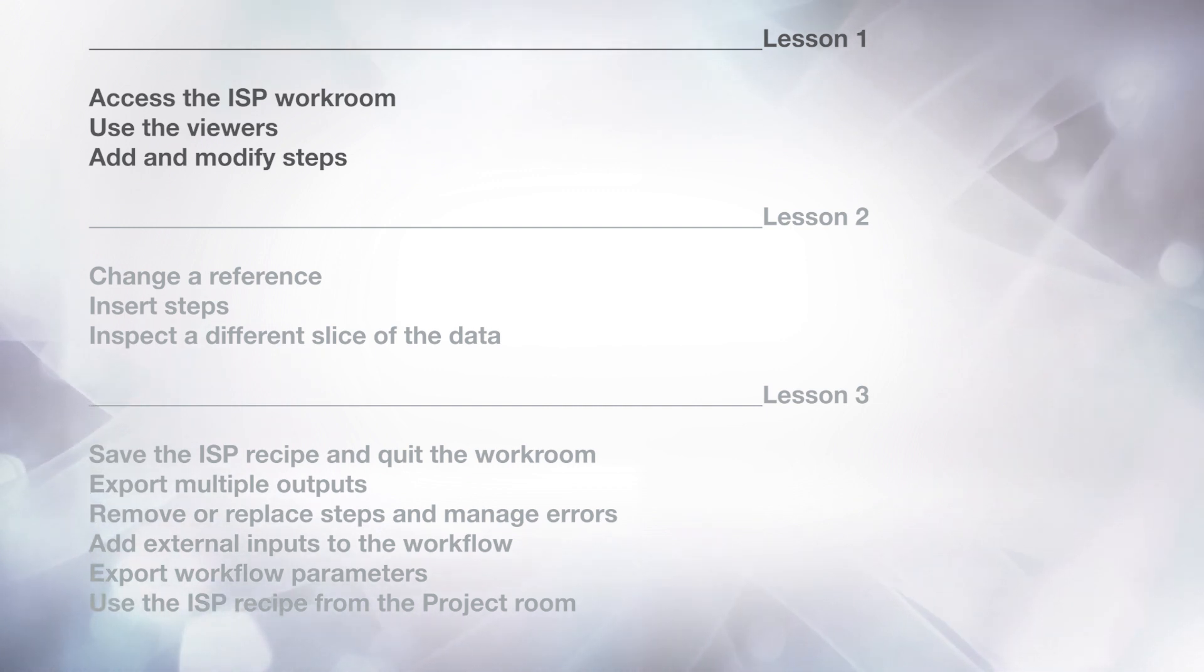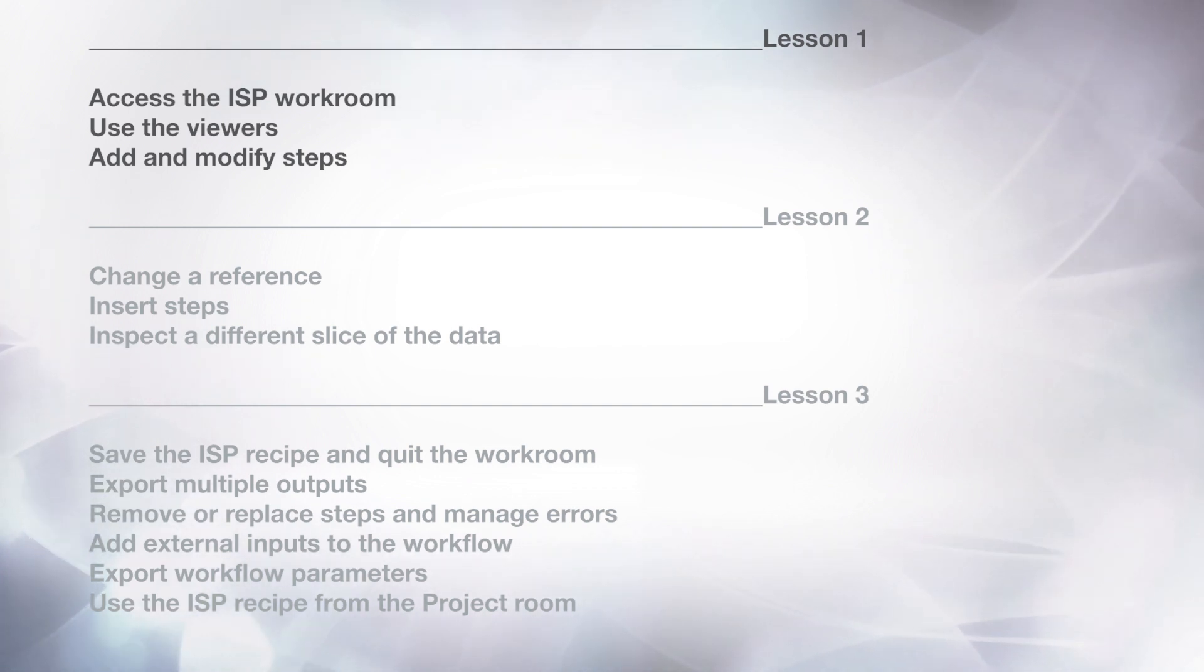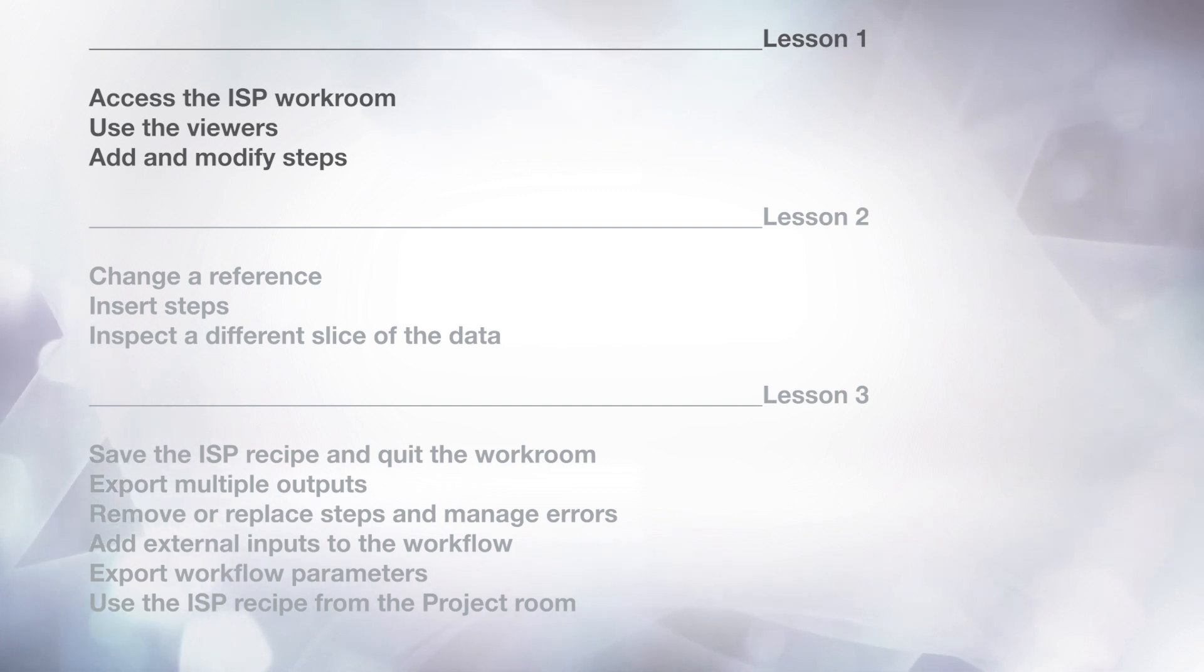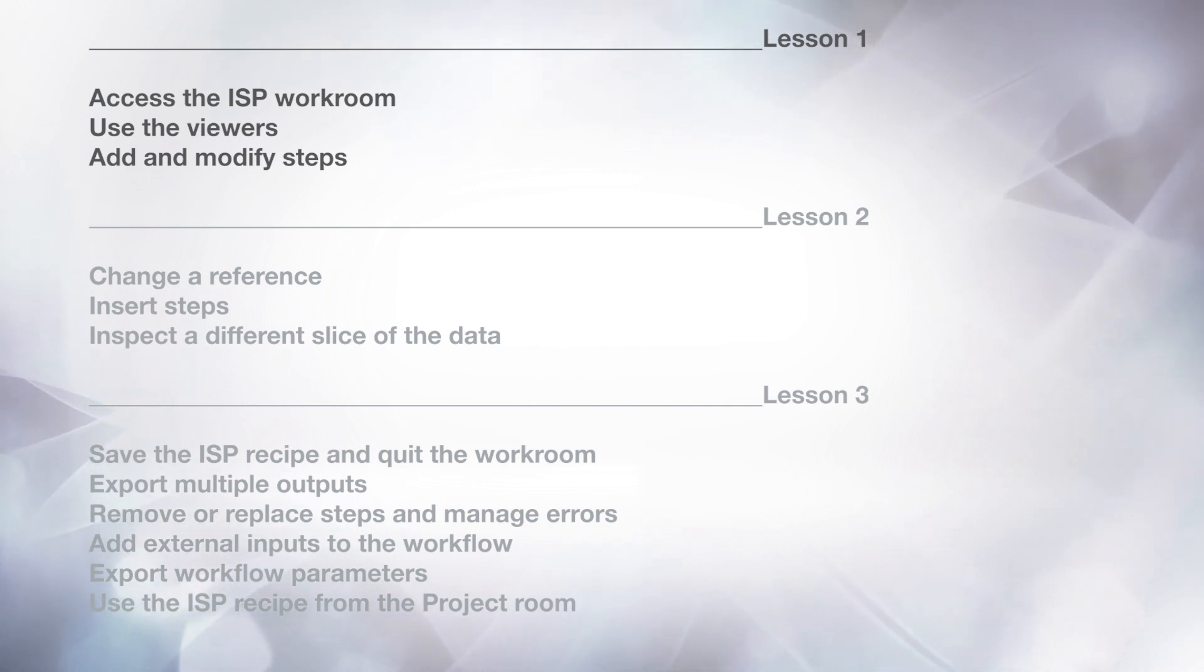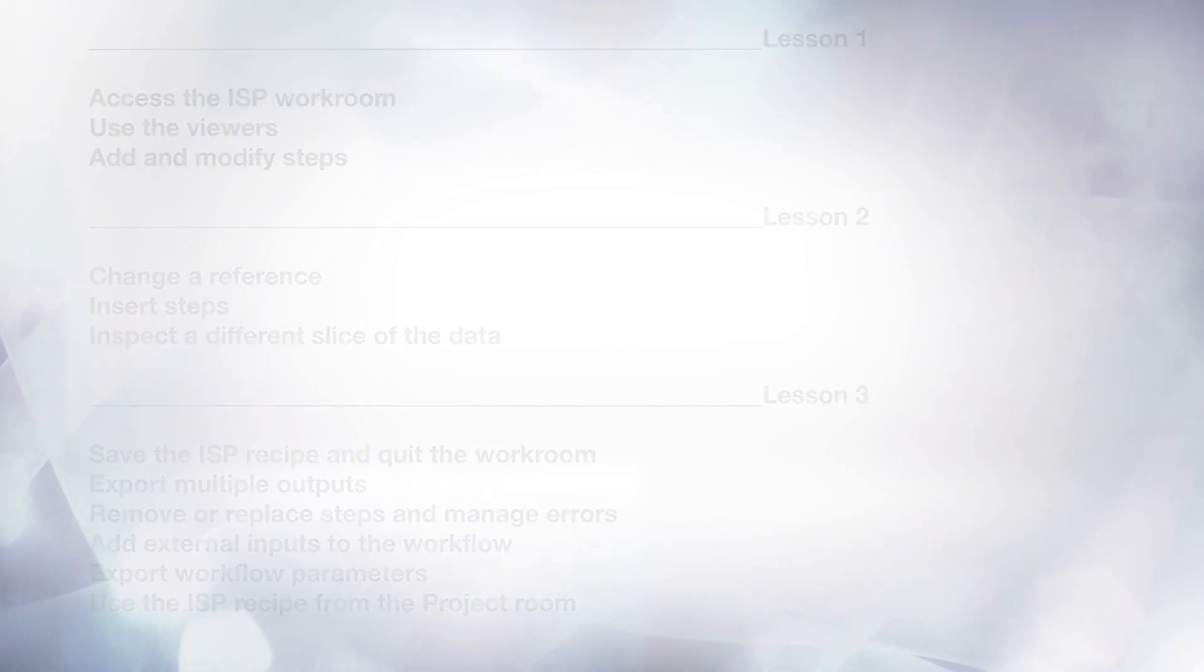In the next two lessons, you will learn how to change the reference, insert steps, inspect different slices of the data, save the image stack processing recipe and quit the workroom, export multiple outputs, remove or replace steps and manage errors, add external inputs to the workflow, export workflow parameters for easy access from the image stack processing module, use the image stack processing recipe from the project room.